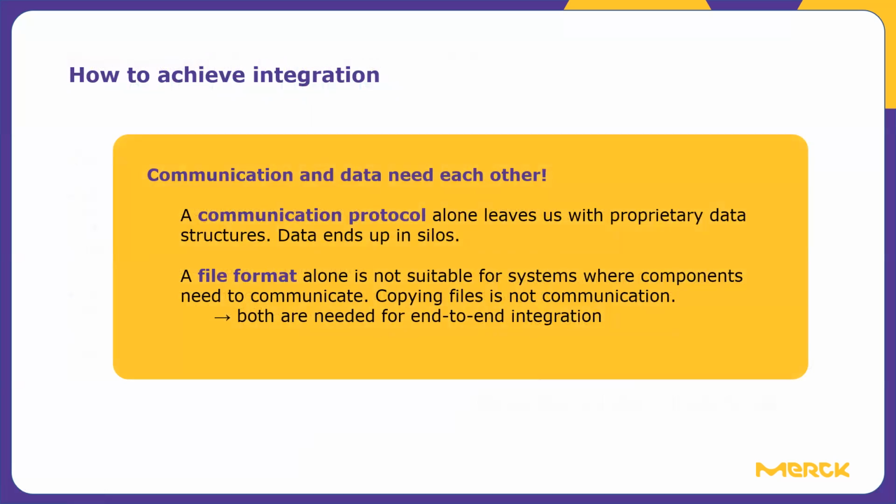So how can I achieve that integration? Well, we have two aspects in this. First of all, we need communication to get systems to talk to each other. And we need to represent data because that's what we are generating and that's what's parameterizing the experiments that are happening.